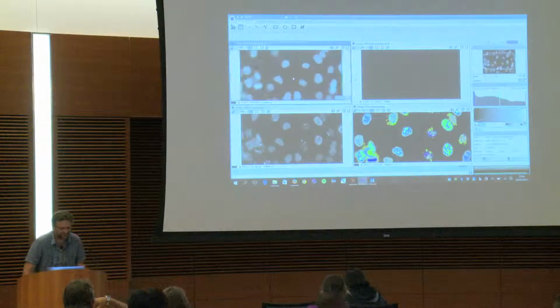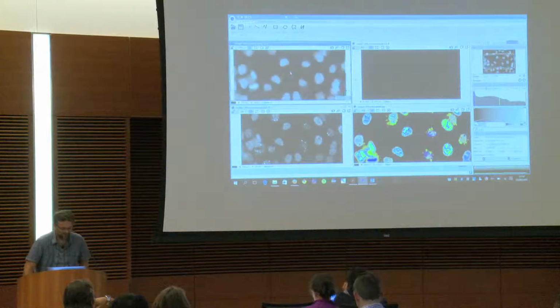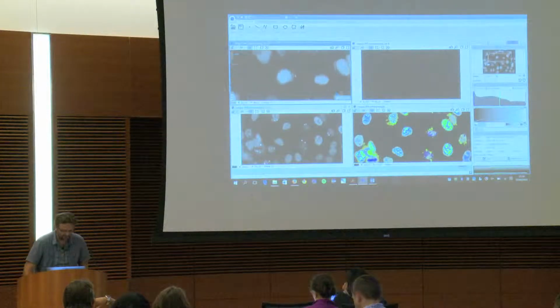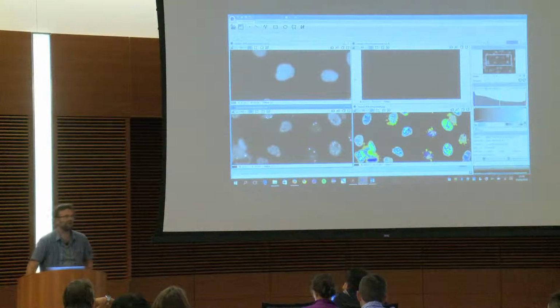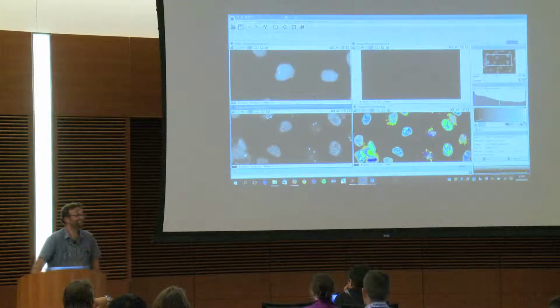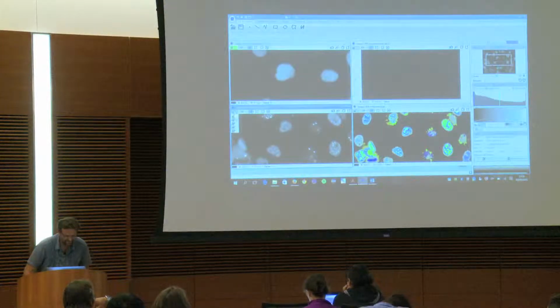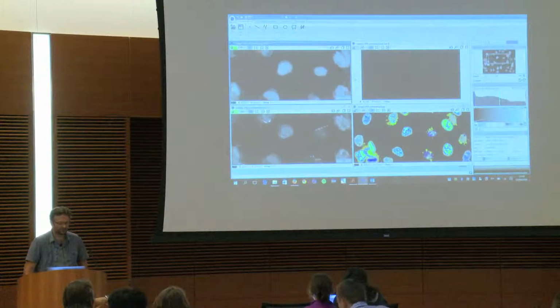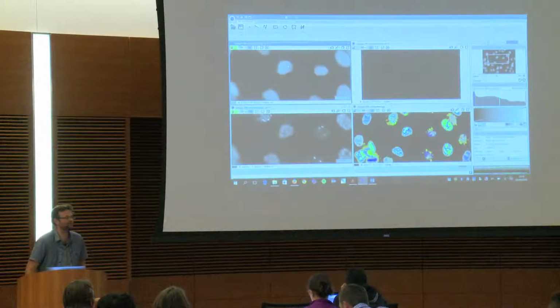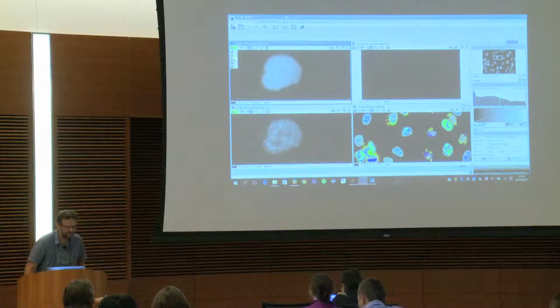Okay, so here I just split the channels, and now I want to observe what happened here in my image, but also in this image. So it's what I showed in the lightning talk, where I was faking a stress. And here you put the #1 lock. And now those 2 viewers are linked together. So you may ask, why do we have the #2, 3, 4?